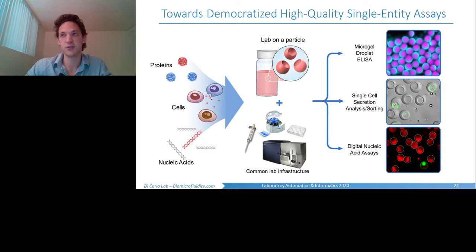I think this is really pertinent now, when it's more difficult than ever to travel and we're trying to limit interactions with others to reduce the spread of COVID-19. And perhaps especially so with some of the applications of the system being particularly suited for potential therapies. For example, for the production or isolation of cells producing neutralizing antibodies, this could be a really powerful approach that many people could use.